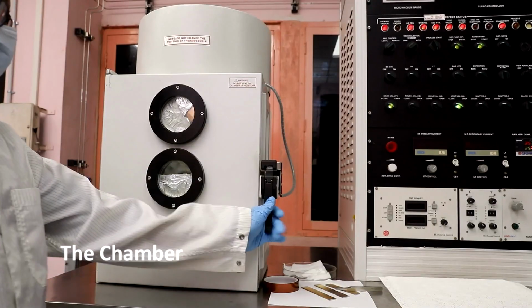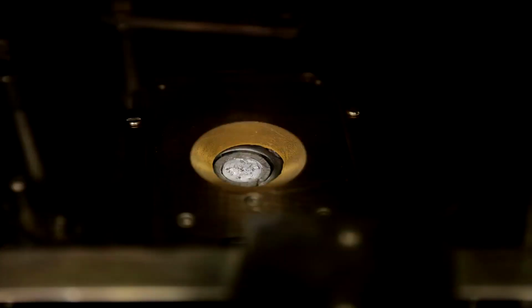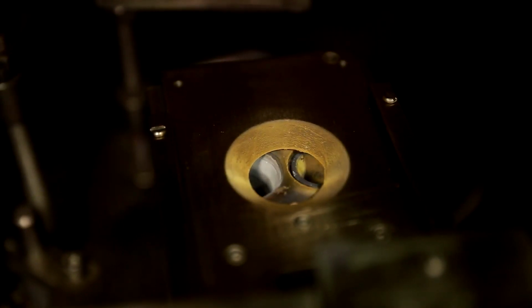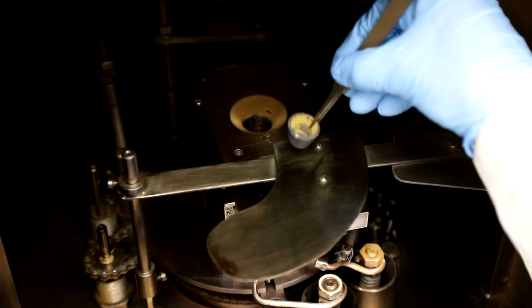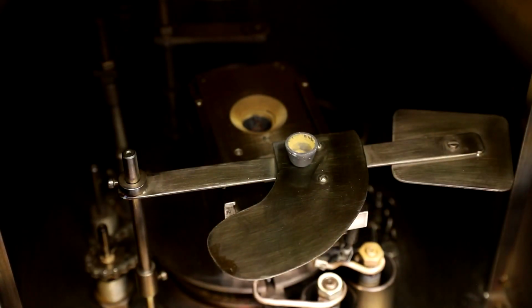About the chamber. Here we can see the chamber for vacuum deposition of metals or other materials. In the present case, we are going to deposit chromium. The chamber consists of two main sections: an electron source, which is here, and a crucible, hearth, section that holds the material we want to deposit. This is the crucible, where we keep the source material, which is evaporated using the focused electron beam on our target substrate, which is kept here. This crucible is made of tungsten.